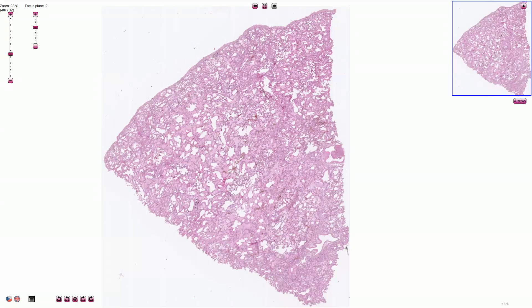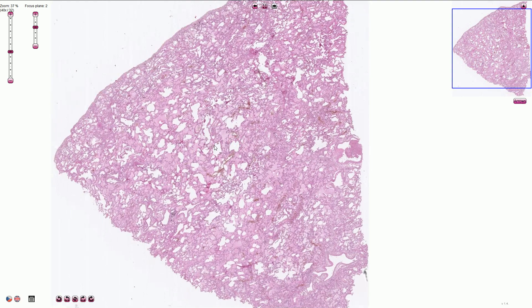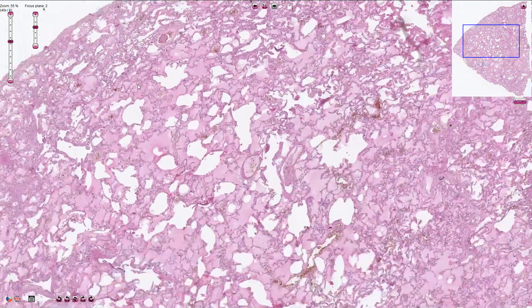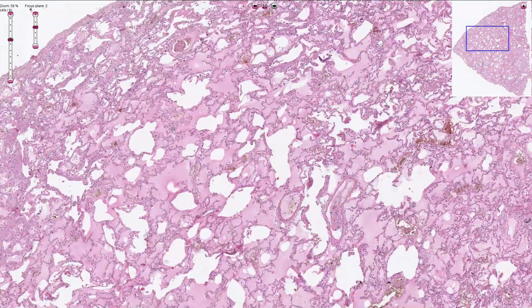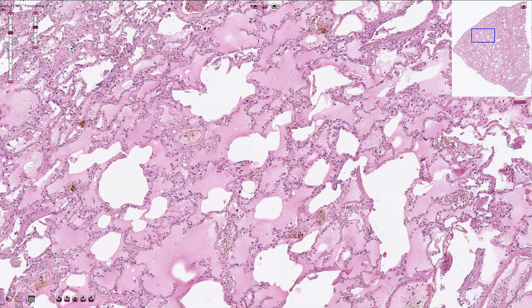Here we have a piece of the pulmonary parenchyma affected by severe pulmonary edema. Almost all the alveoli are filled with a slightly eosinophilic edematous fluid. This is the pleura on the outer surface of the lung, and on higher magnification we can see alveoli with the inter-alveolar septi.